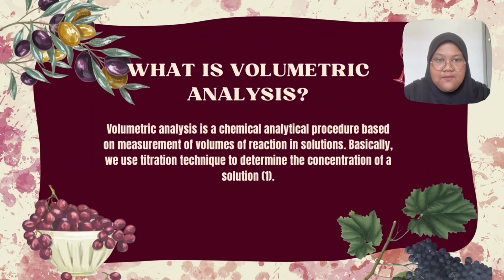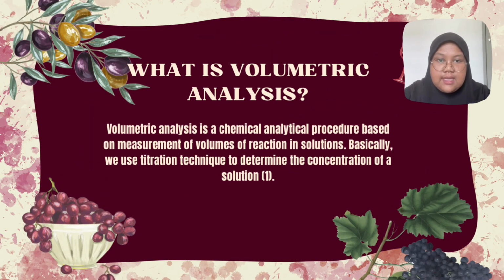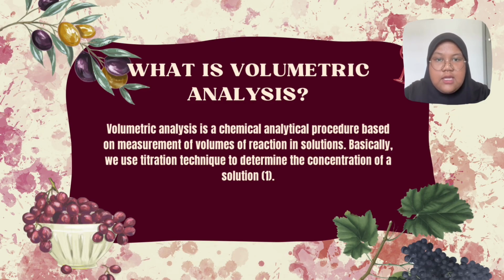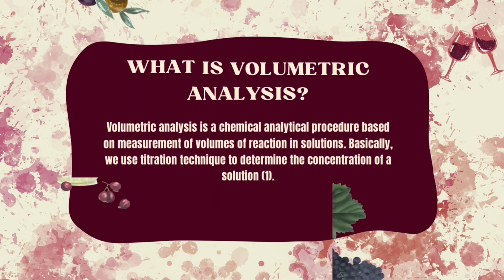Now, let's dive in and know what is volumetric analysis. Volumetric analysis is a quantitative method used to determine the concentration of a substance by measuring the volume of a solution involved in a chemical reaction. It is commonly performed using titration, where a solution of known concentration reacts with a solution of unknown concentration. Volumetric analysis is widely used because it provides accurate and reliable results.